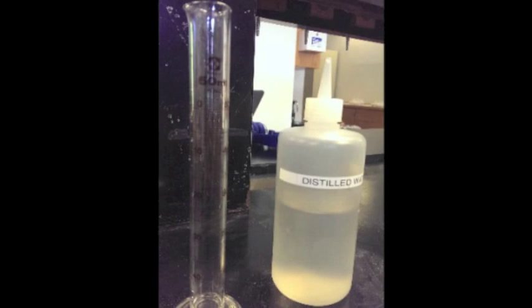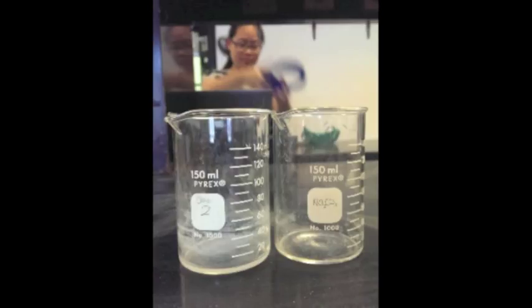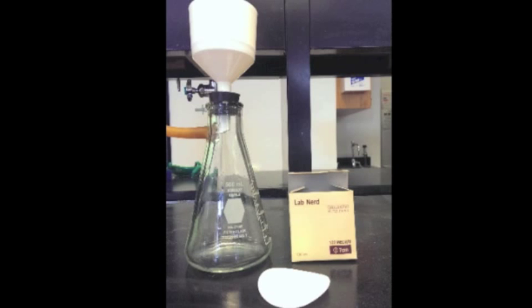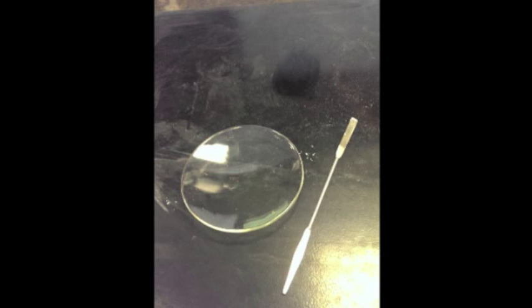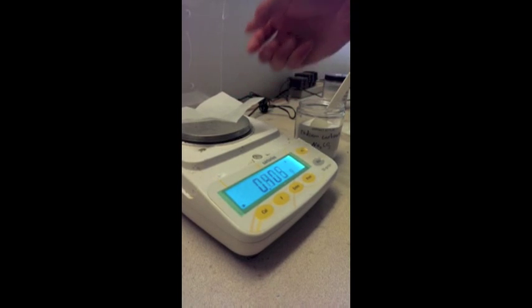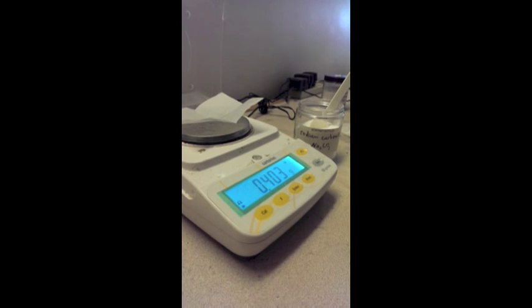First, we'll need distilled water, 50 milliliter graduated cylinder, two 150 milliliter beakers, unknown calcium halide and sodium carbonate, sidearm, Erlenmeyer flask with tubing and Buchner funnel, filter paper, watch glass, and spatula. First, zero the scale using weighing paper, then mass out 2.5 grams of sodium carbonate and 2 grams of unknown calcium halide.